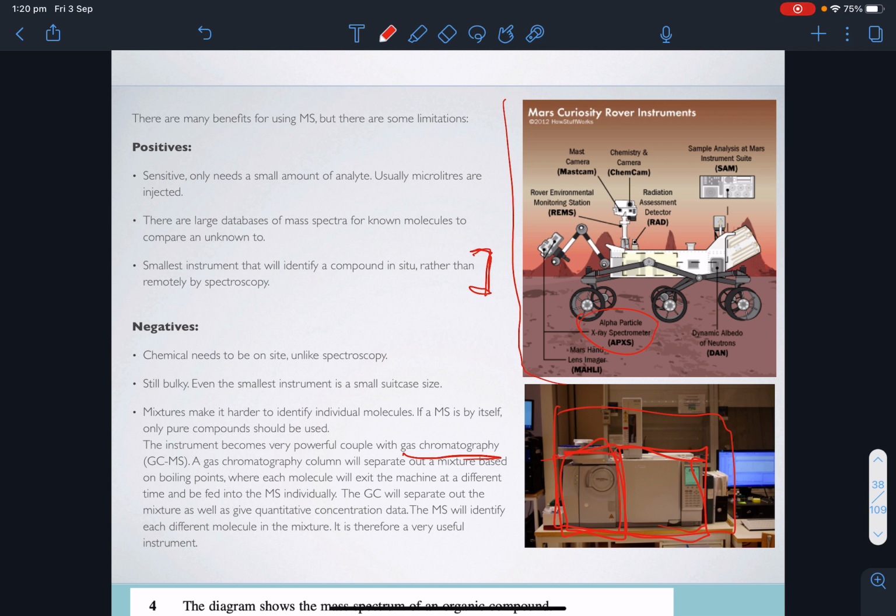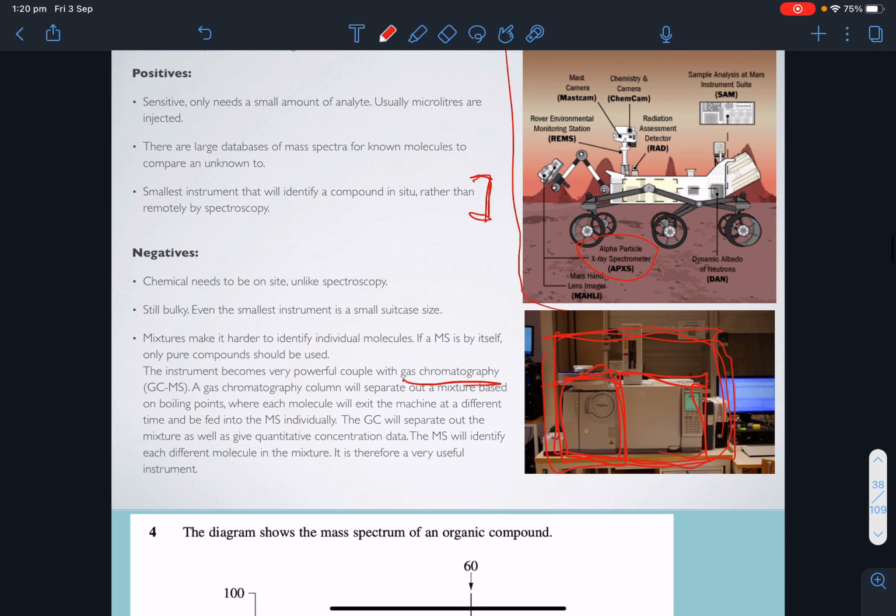You can inject any mixtures in there. These machines are very widely used, and they're the ones that you're seeing on NCIS and all those other forensic shows. They're the type of things that can be that handy, like in the show, but not quite as handy. They're very definite in their findings in the show. Okay, I think I've mentioned enough. So the negative is you cannot use a mixture, but you can couple it with a separating technique like gas chromatography, and it becomes this wonderful, wonderful thing that's used widely.